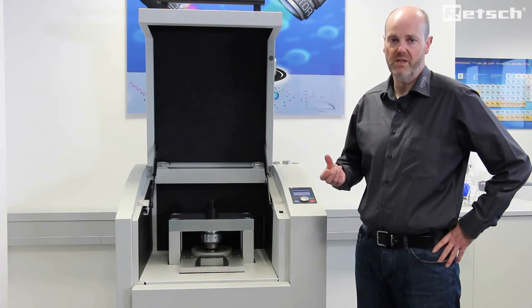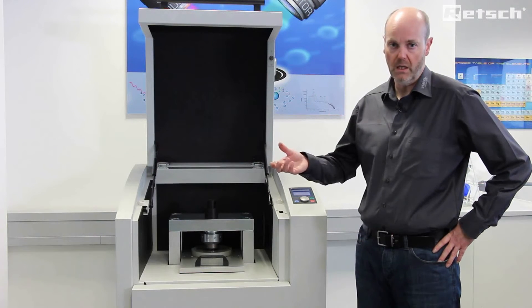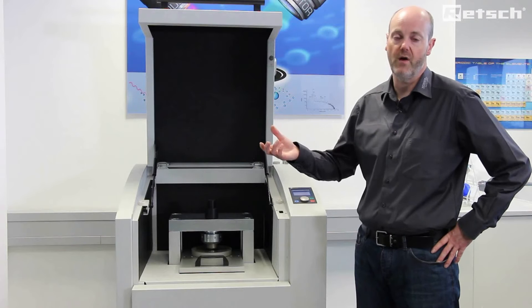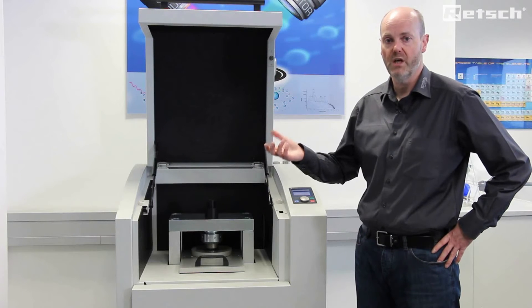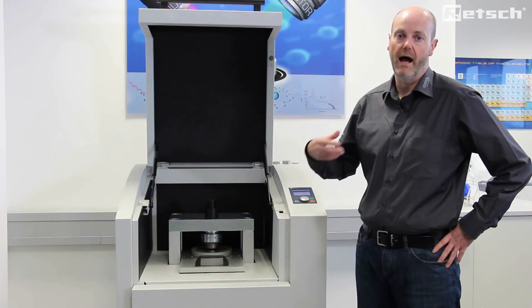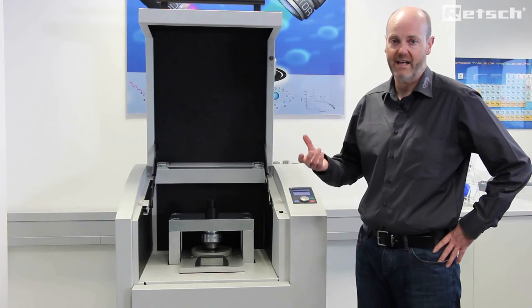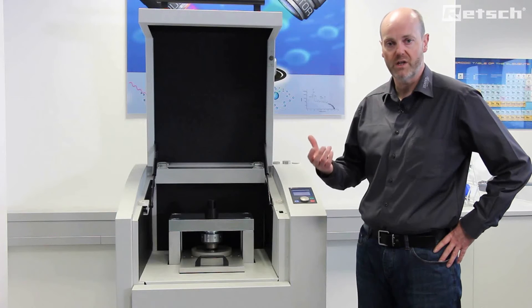Once we have prepared the material in the suitable mill, such as either the vibratory disc mill RS200 or RS300, to analytical grade fineness — typically below 40 microns — we will take that powder and, depending on the physical characteristics of the sample material, add it to a binder to increase cohesiveness.